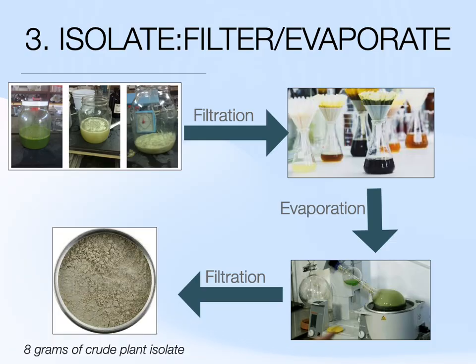So at this point, the lower picture in the lower right corner is depicting the removal of the solvent, because at this point the solvent is no longer necessary since it has done its job as a vehicle to remove the actual phytochemicals from the original plant part itself. Having done this, we can now remove the solvent by evaporation.